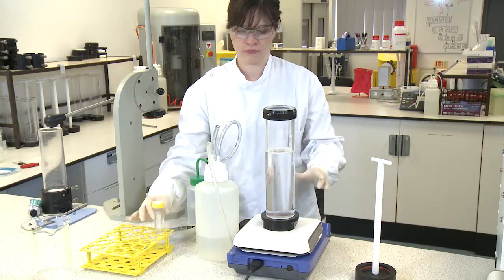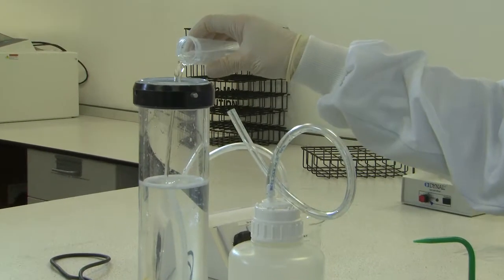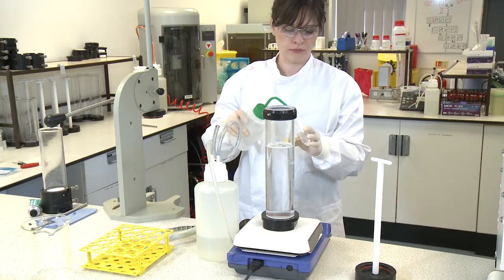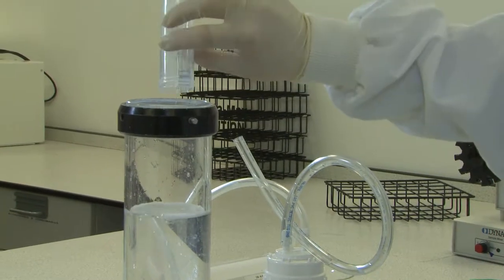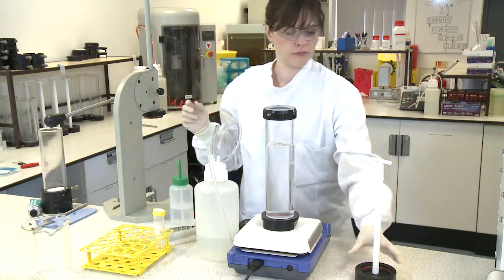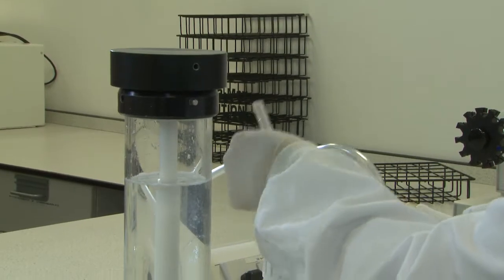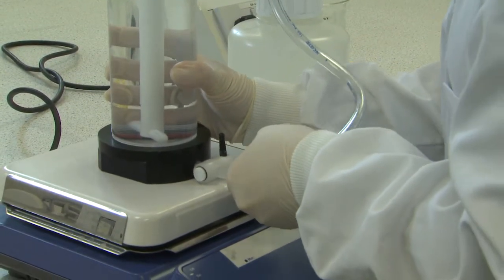Add the concentrated eluate retained from the first wash to the eluate from the second wash. Rinse the 50 milliliter centrifuge tube and add to the second wash eluate. Attach the magnetic stirrer bar. Connect the waste bottle with the hand pump to the tap on the concentrator base and begin gentle stirring.